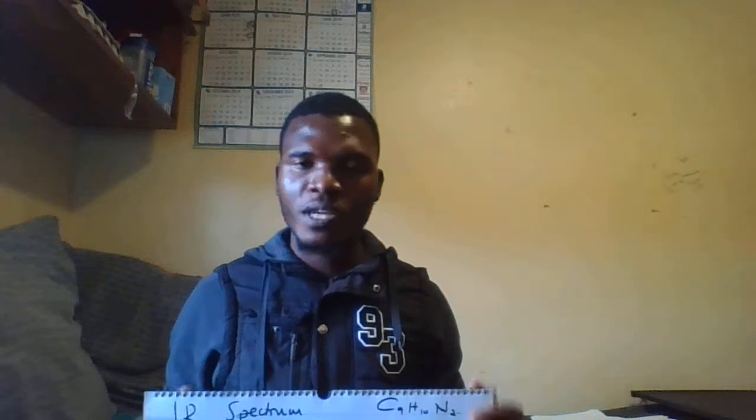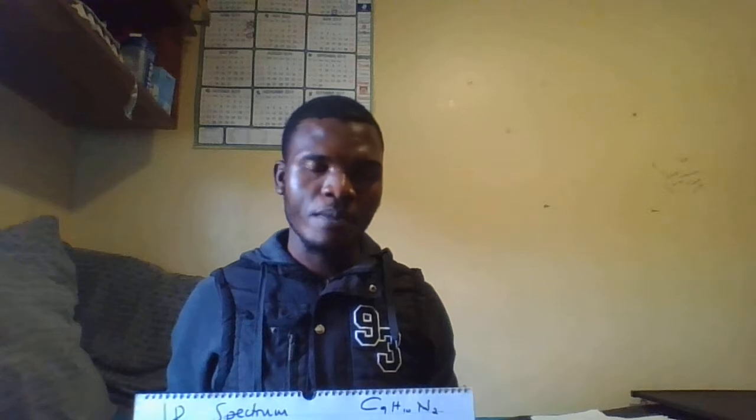So when you Google C9H10N2 with an idea of what is the composition of your structure, like now you know there's a benzene ring, there's a triple bond, there's also a carbon bonded to a nitrogen, and you are also expecting to see the CH3 carbons, the primary carbons. So it can give you a clue of what kind of a structure it is. So when I Googled, I found something like this.